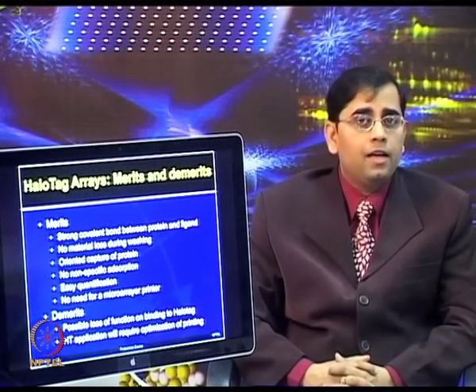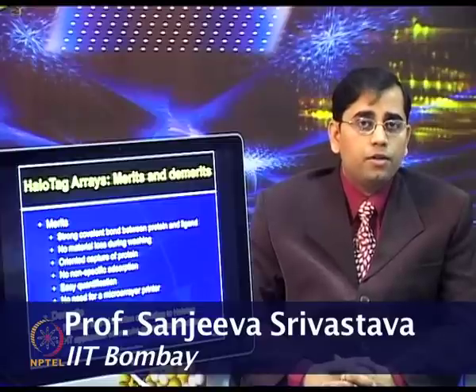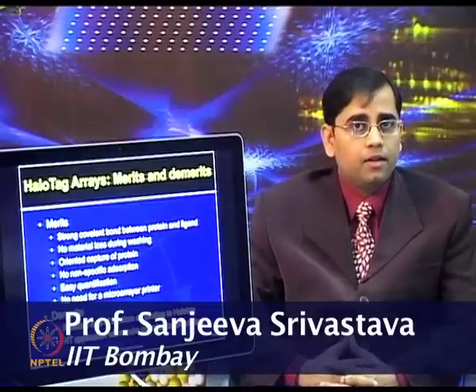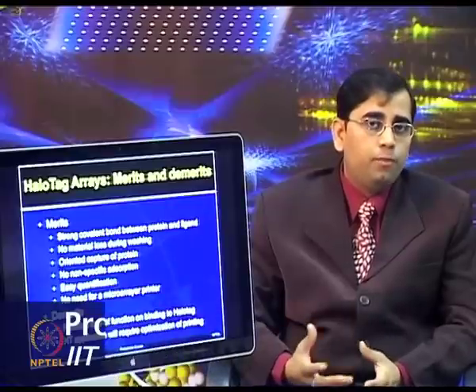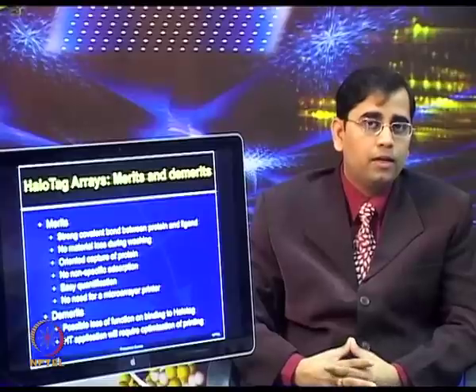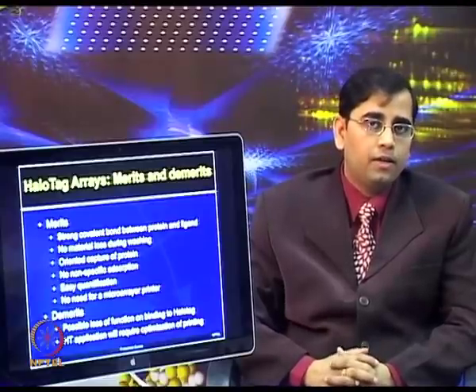However, there are certain limitations of using HaloTag arrays. At least it has not been shown that the system can be used for high density arrays. So, only proof of concept studies have been shown with few spots by using commercial gaskets which can do 50 or so proteins.